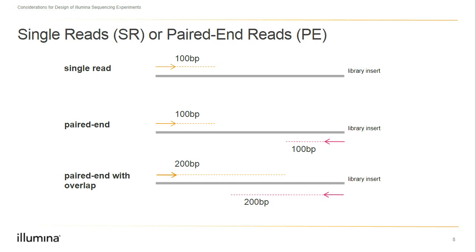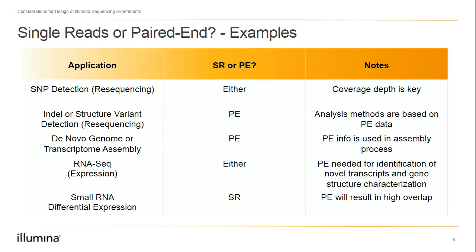Deciding what kind of reads will depend on the pipeline that you plan to use and its requirements. Now that we've discussed the types of reads, let's talk about a few applications for the different types.